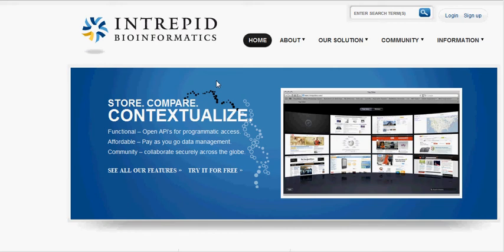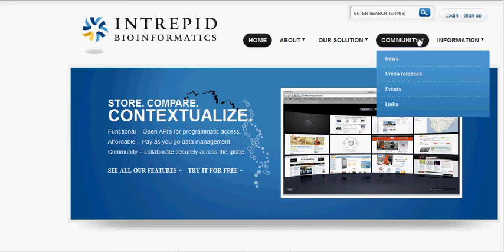Hello, my name is Brian Lerman, Director of Operations at Intrepid Bioinformatics, and I'm going to talk to you about some of the data management solutions that we offer with our system. In this video, I'm going to talk about uploading files and sharing them.